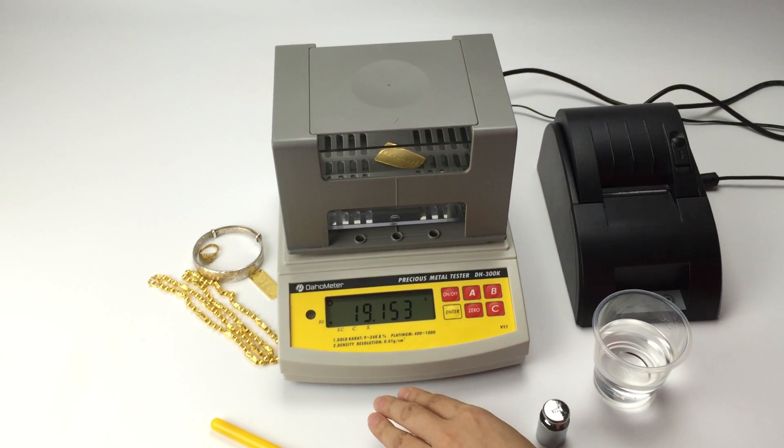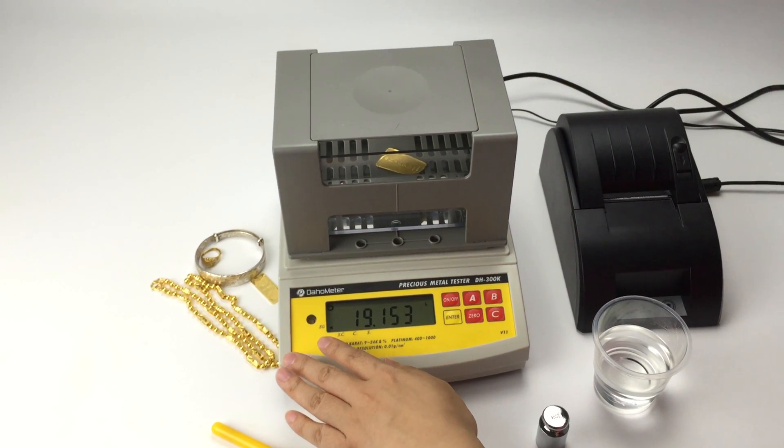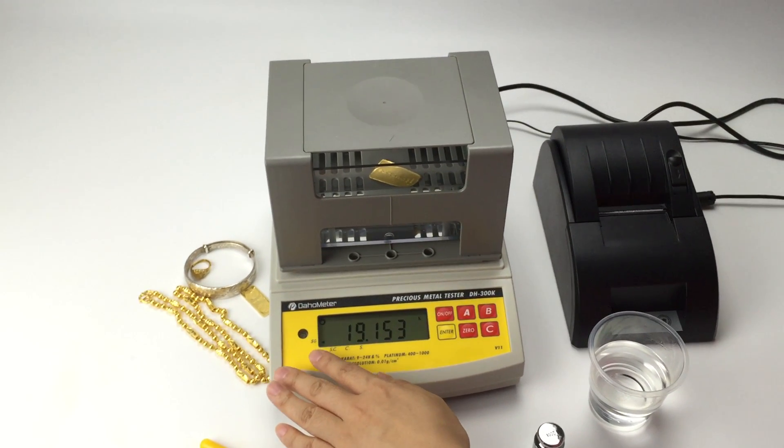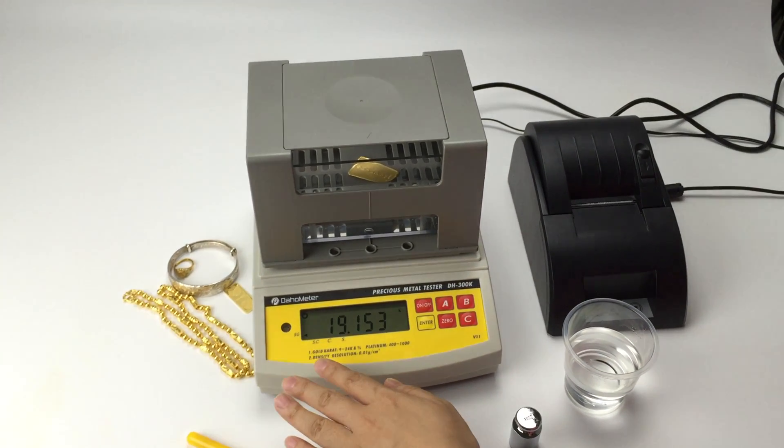Press A again. Then the arrow is directed to SG. SG is the specific gravity for this sample.